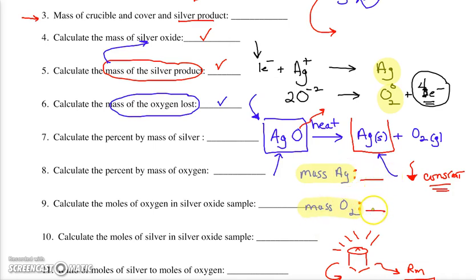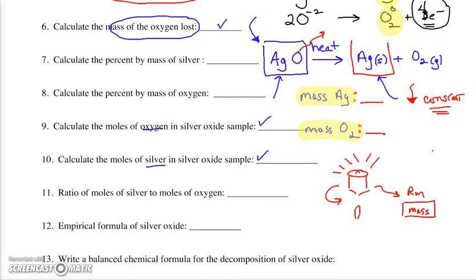And then we divide by the smallest moles. And that would give us the moles of the oxygen, the moles of the silver, and then we have our ratio. Make sure when you write that ratio, if you get 1.8 to 1, write it. I want to know that value. I know you might be rounding that to 2 to 1, or what have you, but I want to know the actual number because I want to discuss why it's not exactly 2.